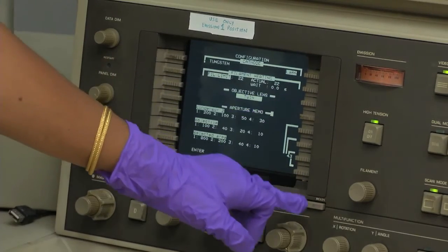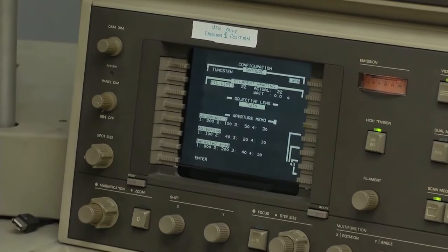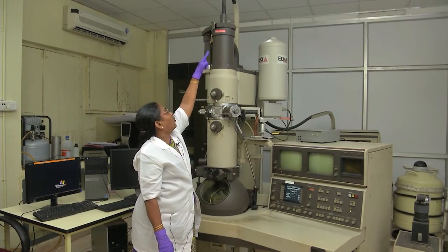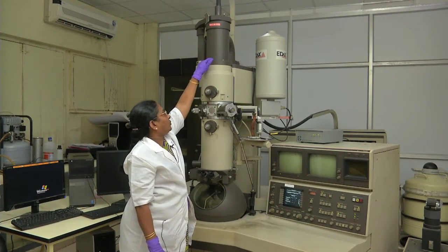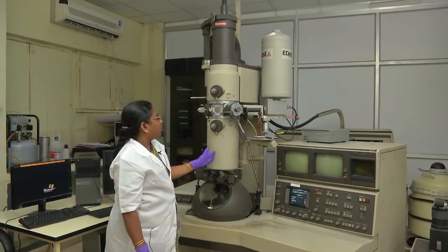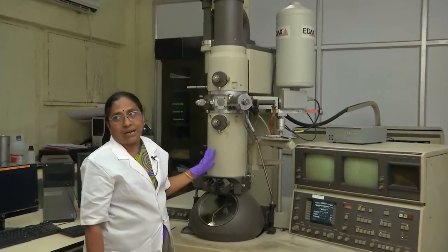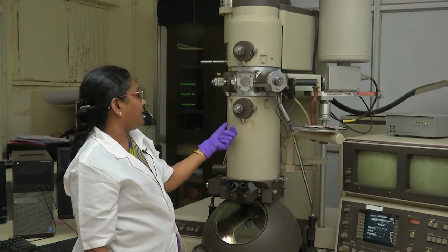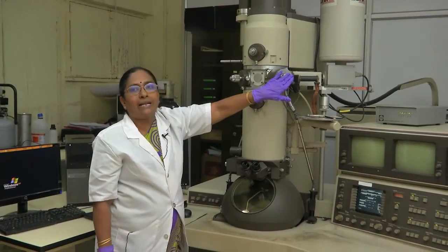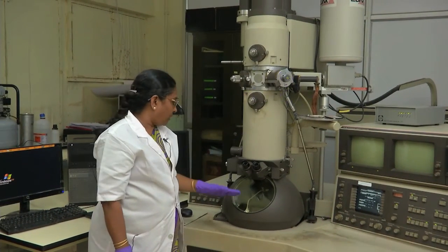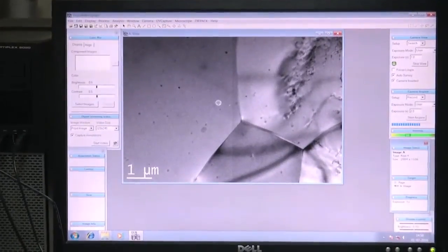I have already heated the filament, so electrons are coming out and are accelerated by the high tension of 120 kV toward the anode. All the lenses are positively charged, so the attraction is toward the lenses and you are seeing the image. I have already loaded an aluminium foil — the image is from the aluminium foil, and you are seeing it on the fluorescent screen and in the monitor.